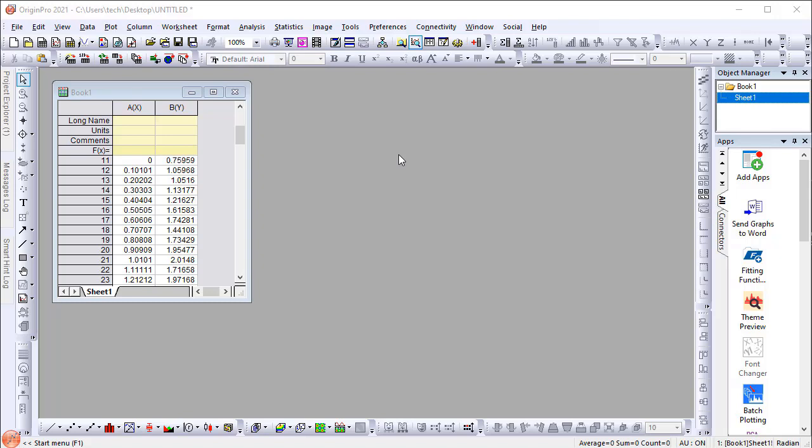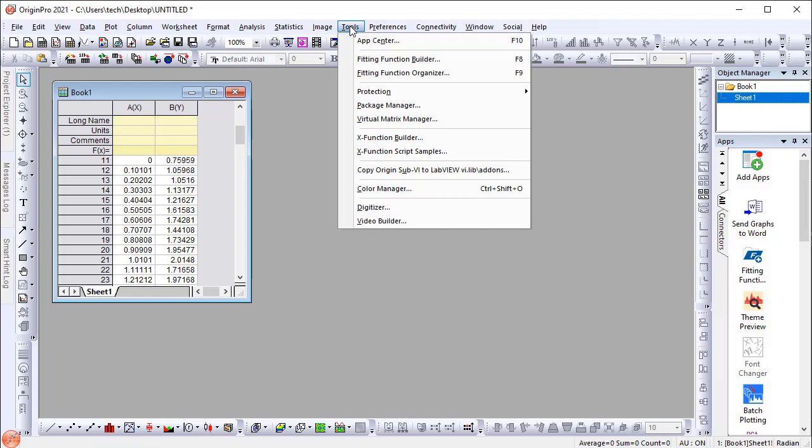First, we need to create a fitting function FDF file with the fitting function builder. From the Tools menu, open the fitting function builder.